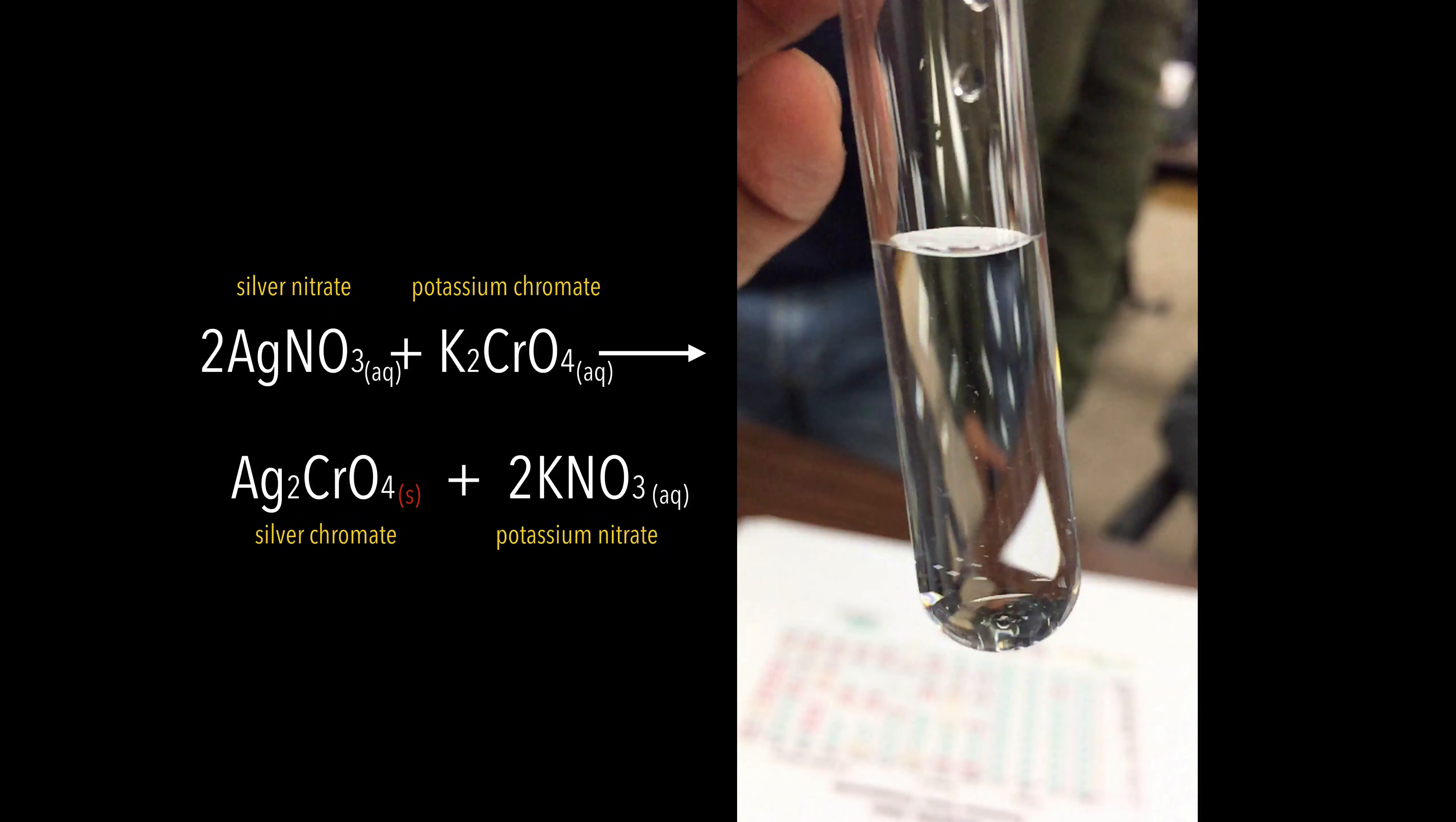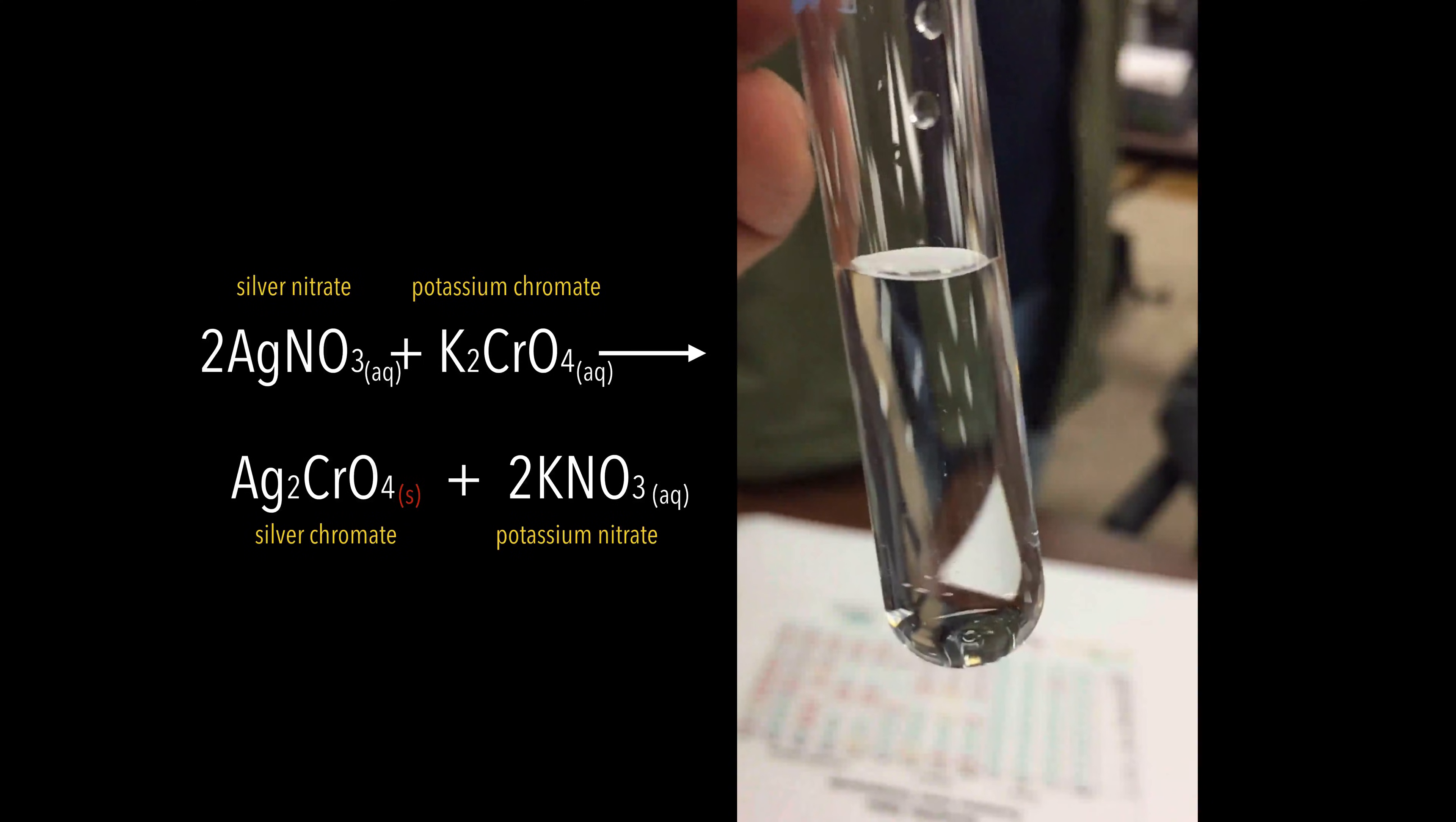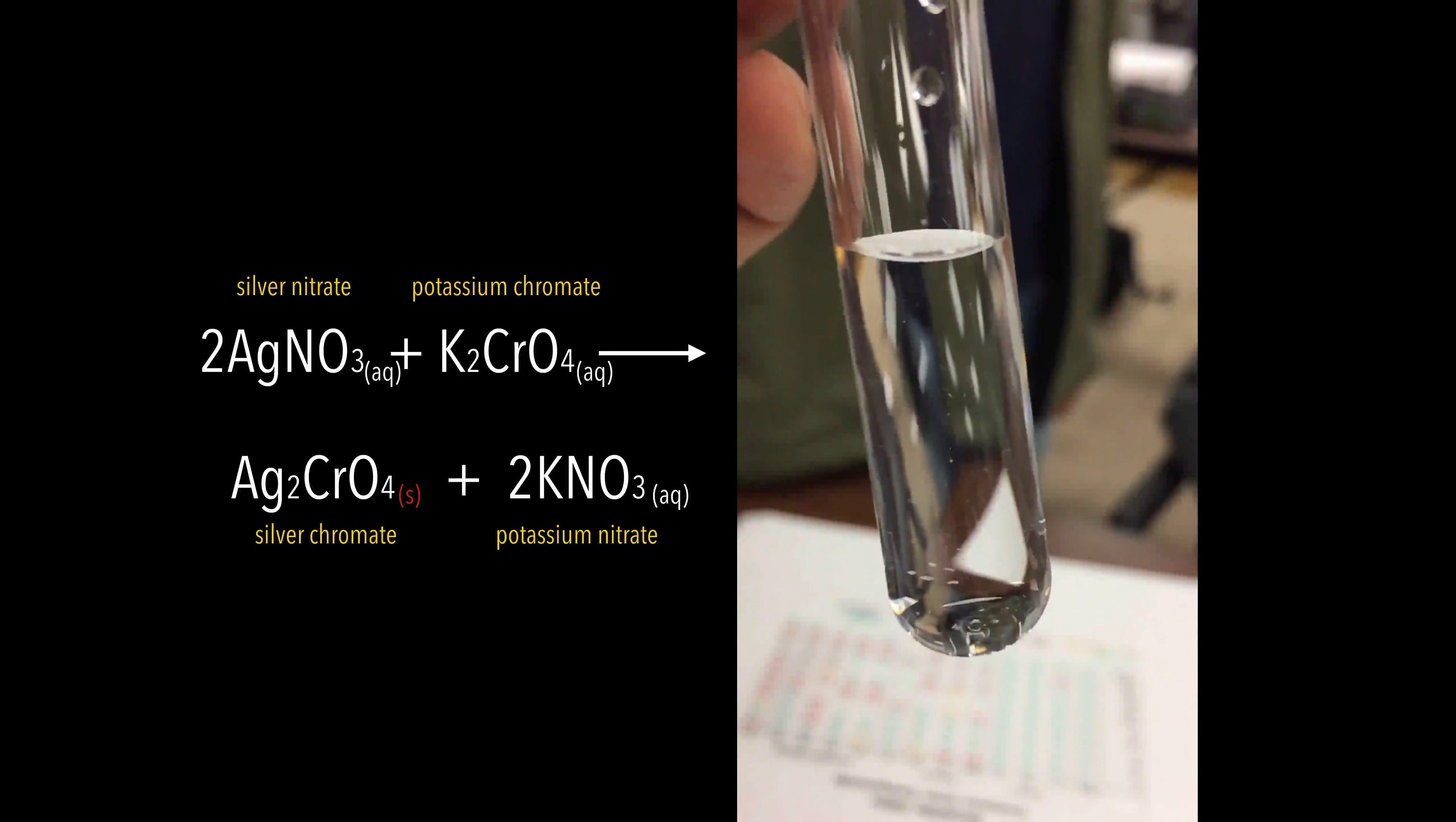This time we're taking a look at silver nitrate aqueous solution mixed with potassium chromate. Both of these solutions look like clear water. Pay attention to what happens here. I'm going to put it in slow motion for you.